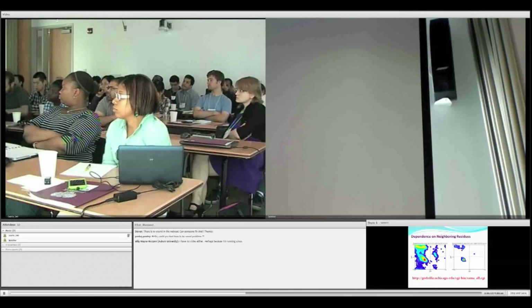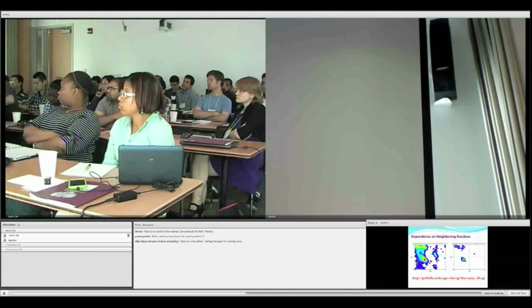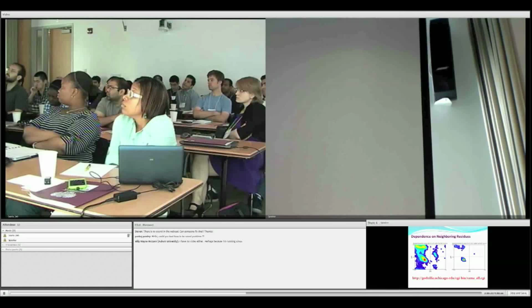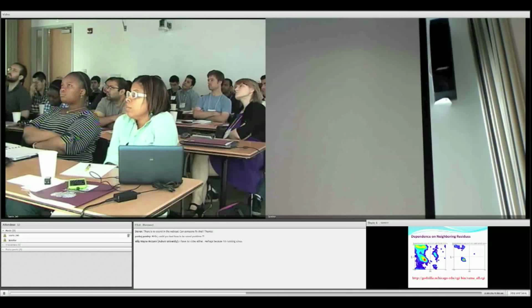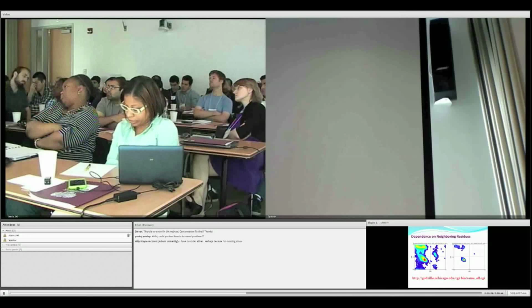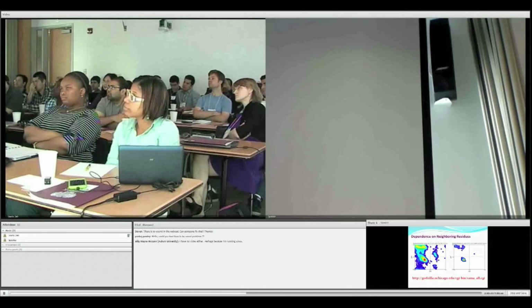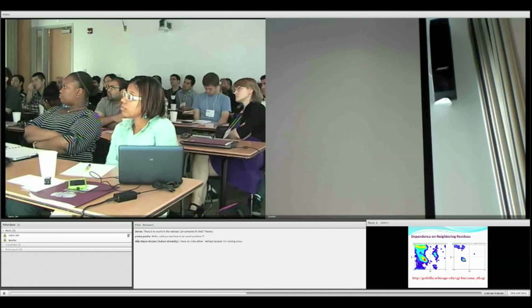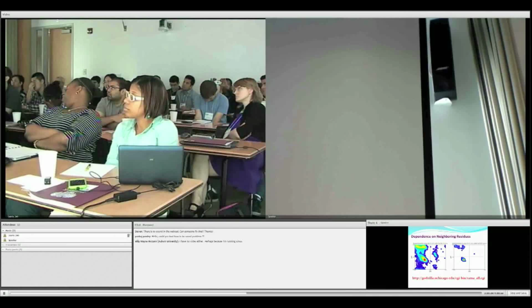Okay, so this is everything. So let's call this state 0. This would be state 1. For each specific amino acid, we have a specific Rama map. Okay? So this is a final resolution of the Ramachandran map. And then you can go even beyond this. Here, what we have done is that we look at the neighbors. Let's say I have an alanine in the middle, and then I want to see what are its neighbors.